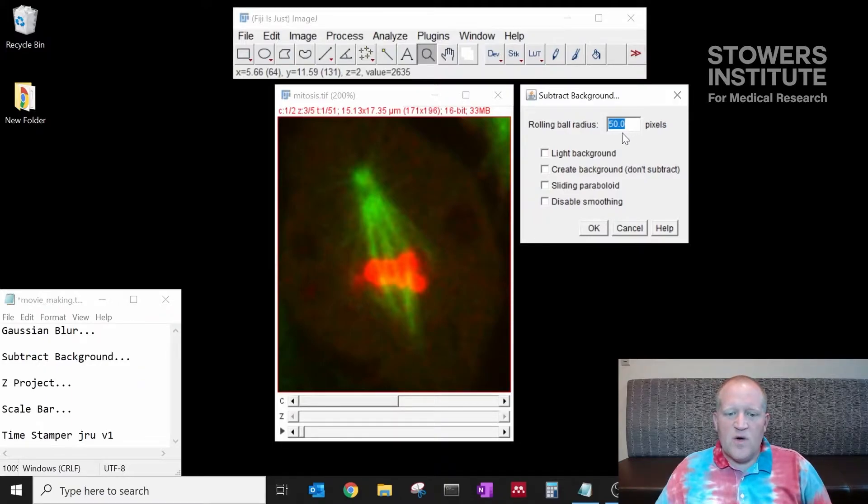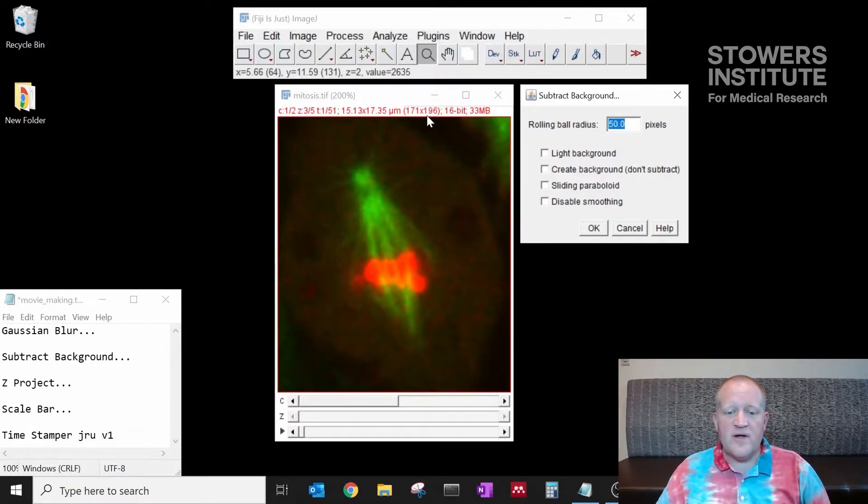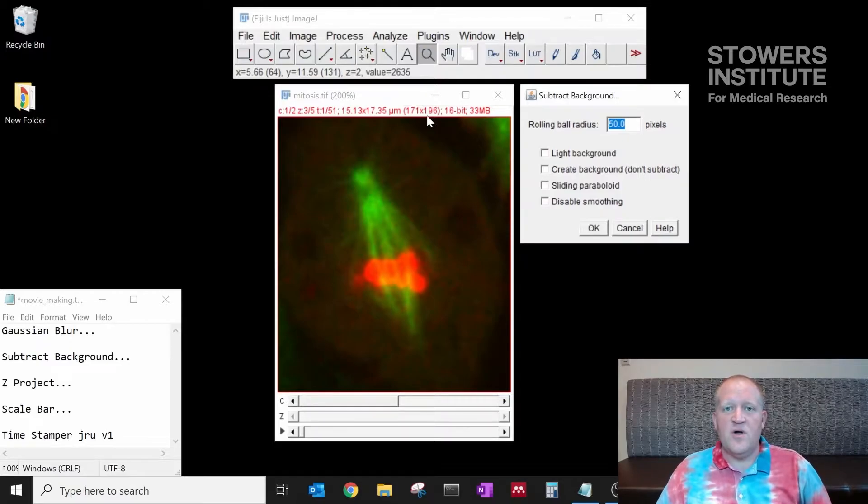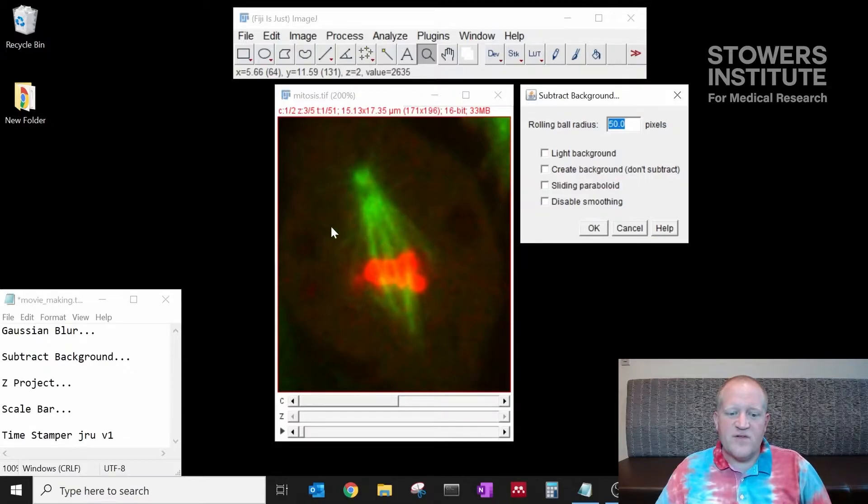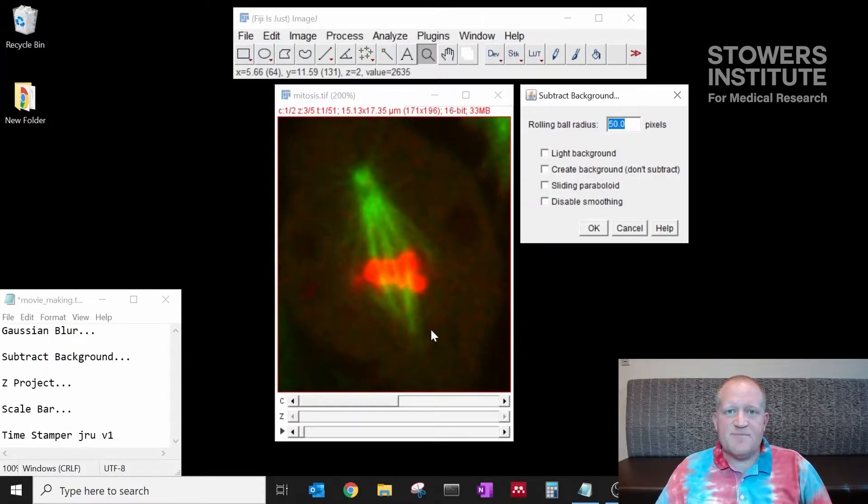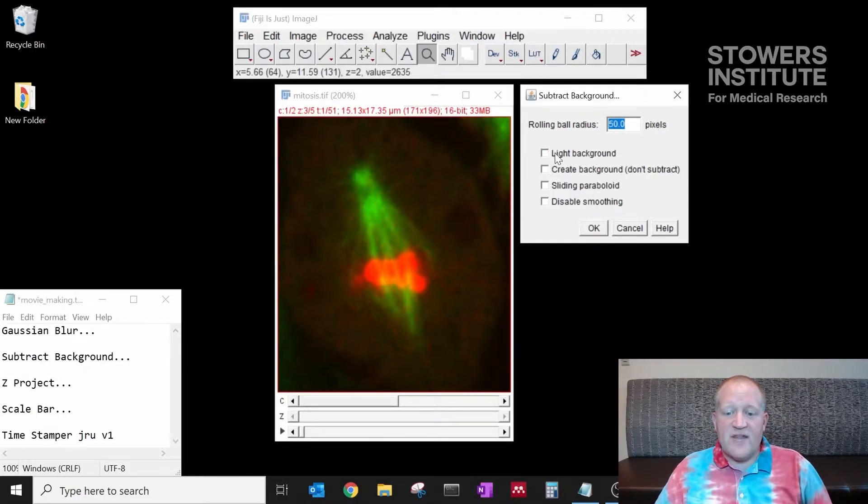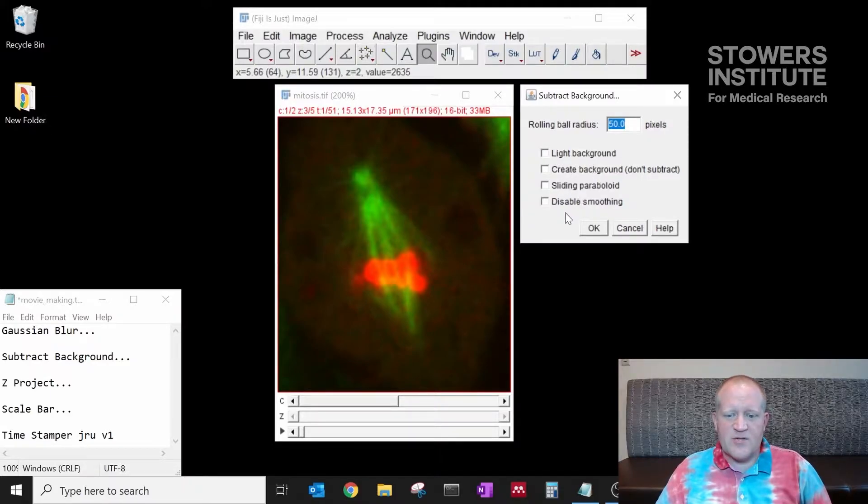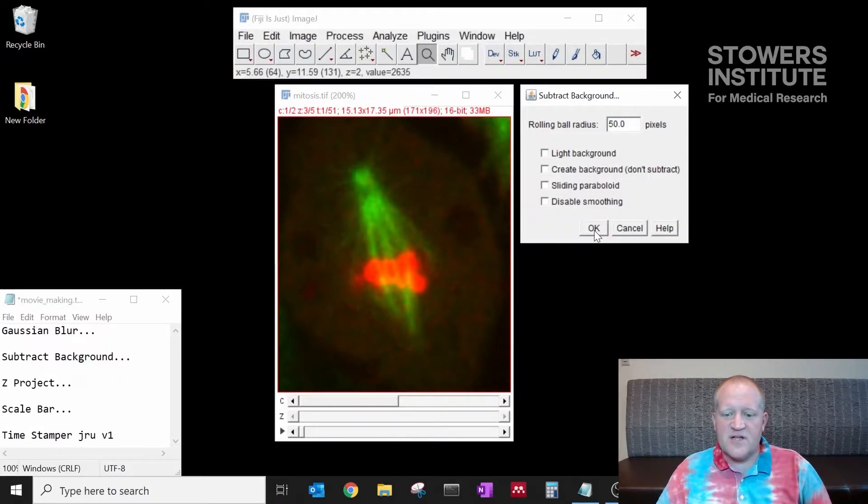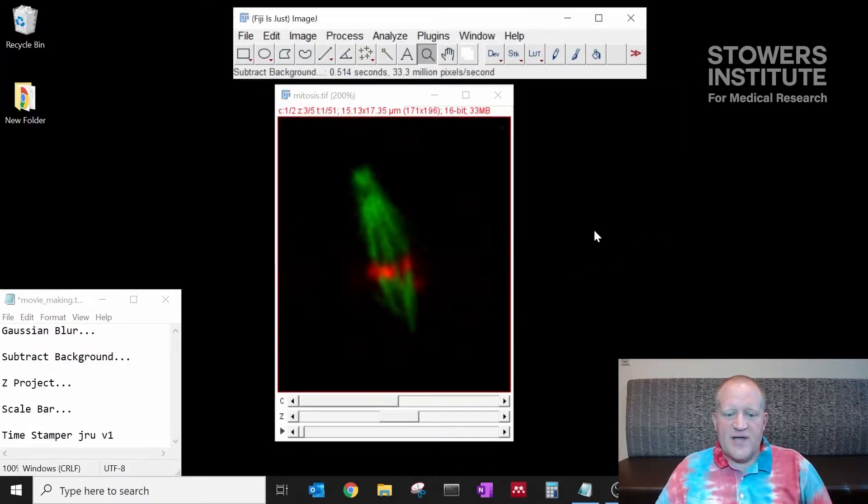The rule of thumb that I like to use is we want to use a radius that is just bigger than the smallest object in our field of view. We have 171 by 196 pixels so that sets the upper limit of what our rolling ball would be. We need to pay attention to the objects in our field of view and we want to make sure that the radius is bigger than the smallest object. So we're going to use 50 for our data here. We do not have a light background and we're going to disable these other options as well.